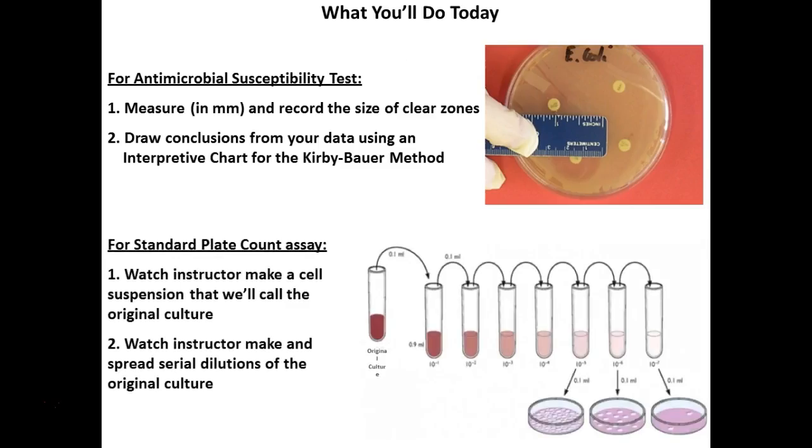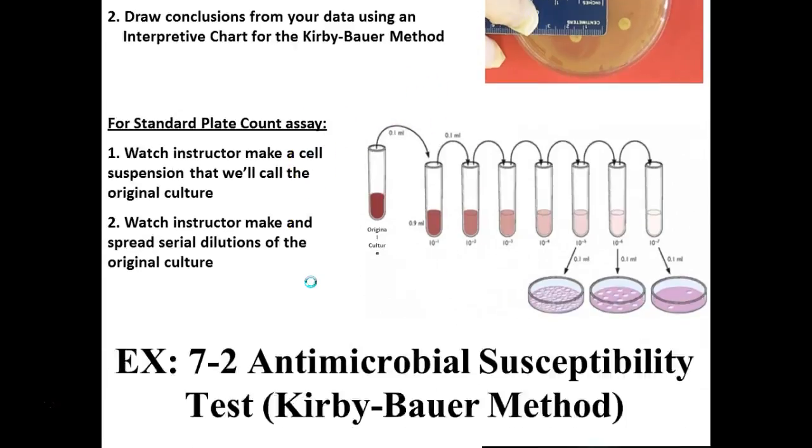So, you guys started out measuring in millimeters the zones of inhibition on our plates, right? Except I wrote out lines for us to make it easier and so that they were as accurate as possible, because we didn't do it the next day. So in this picture, anyone know what type of organism this big white mass is?